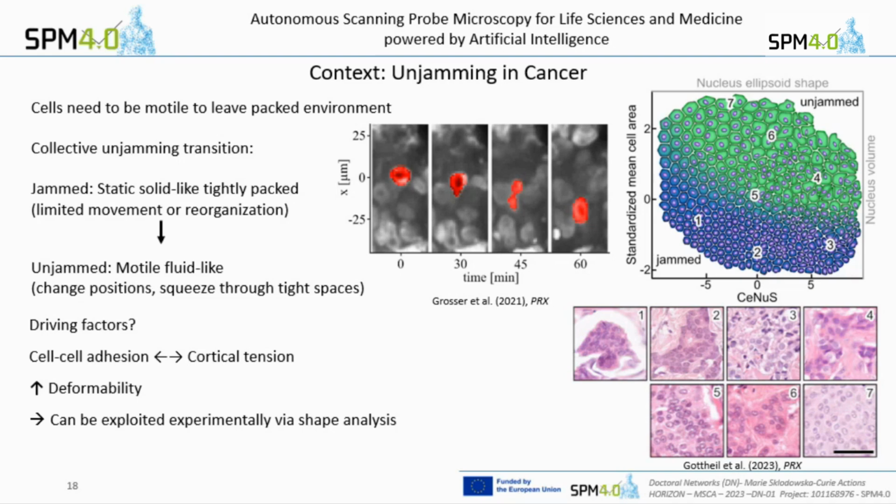And let me make this maybe a little bit more clear. With that, you now get from static images information about the activity of your cells by analyzing the shapes of the cells. As I said before, they've done it for many thousands of samples and derived a marker from it, which, if you combine it with classical diagnosis routines in breast cancer, can improve the overall diagnosis. It's all in this paper. So really cool stuff.